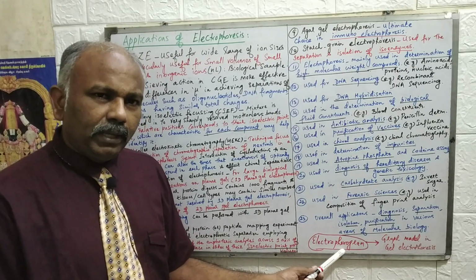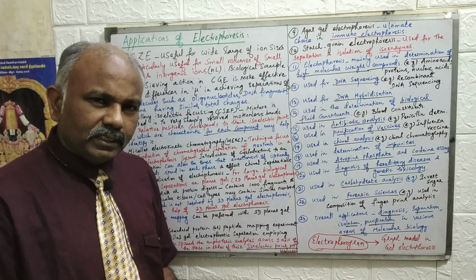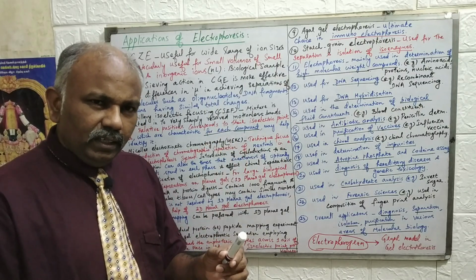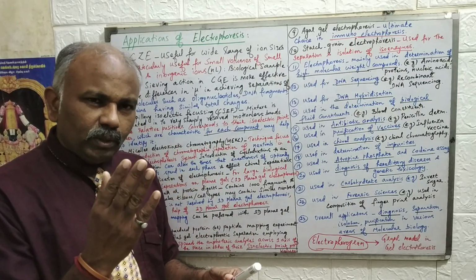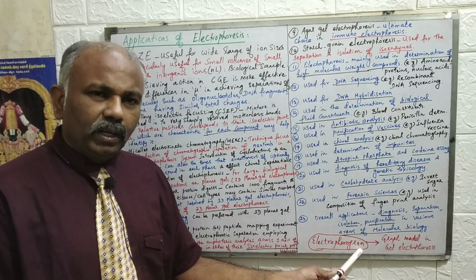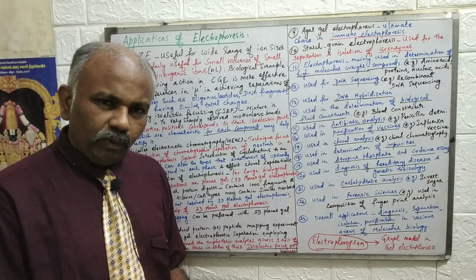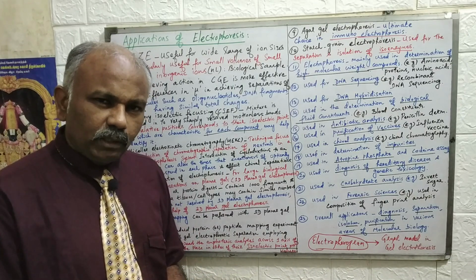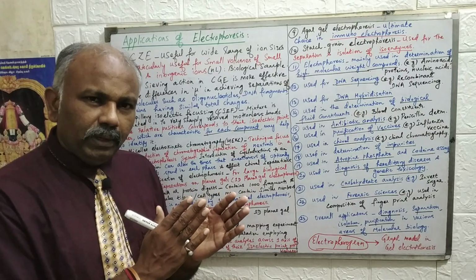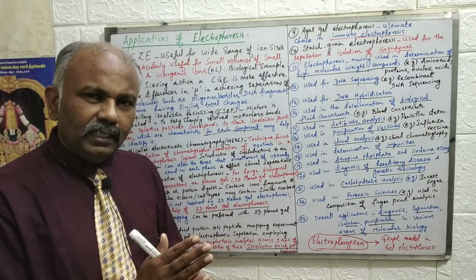This is a graph obtained in capillary gel electrophoresis. Whatever graph we get, we can use it to identify the various nucleotides or fingerprints with the help of the electrophoregram. An electrophoregram is basically a graph obtained in electrophoresis, particularly in capillary gel electrophoresis, and that graph will give the complete identification of the sequences of DNA molecules present in the sample, right?